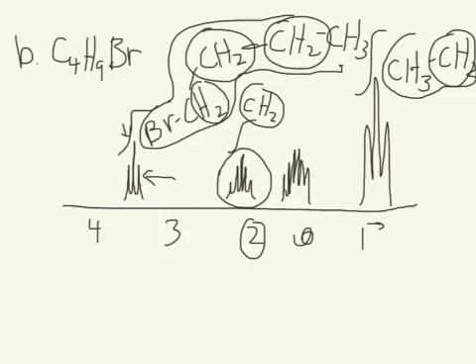And once you get a hypothesis for what your molecule is, you always want to check and make sure the peaks, locations, and splitting make sense. So here's our methyl. It's nowhere near the bromine, so that explains why it's so far upfield to the right on the diagram. Its splitting: 3 peaks, should have 2 neighbors. There they are. We're good to go.